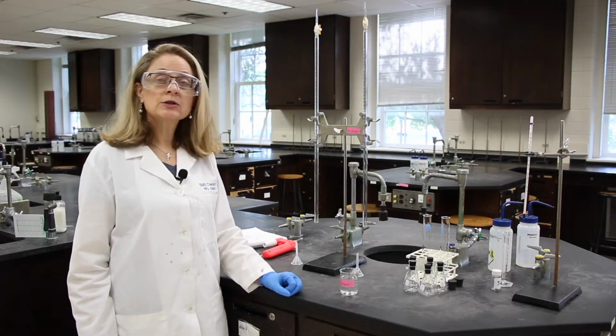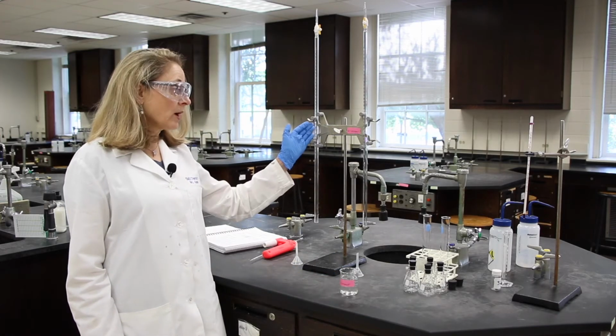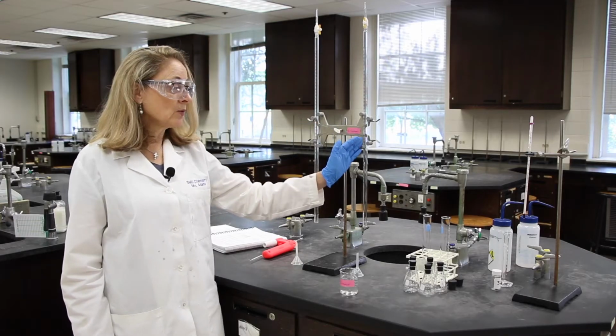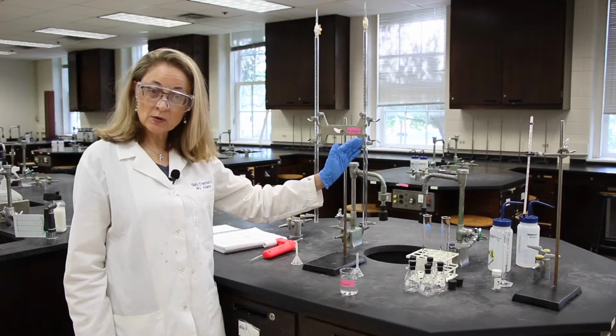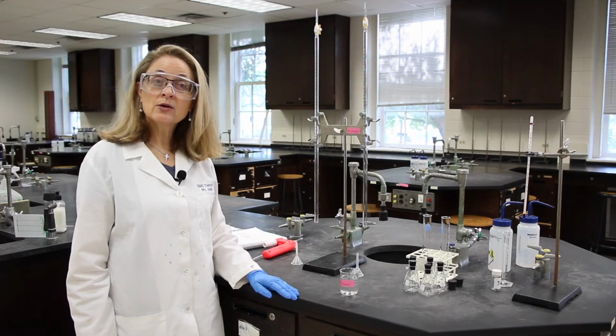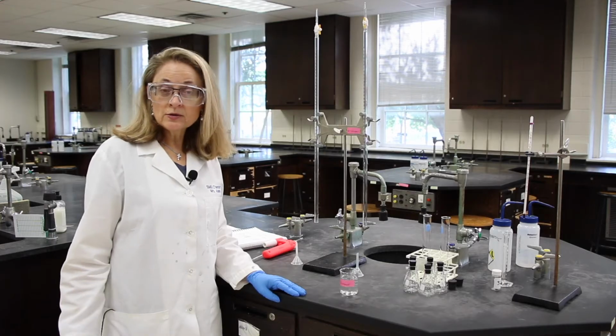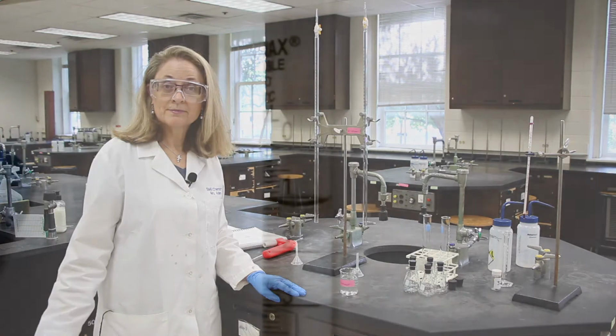And then in steps 2 and 3, the burettes need to be normalized, one with DI water and one with 2-propanol, and then they'll be filled to over the 0 mark and then drained to below the 0 mark, and then we will read them. I'll do the reading and you can record the value on your data sheet.